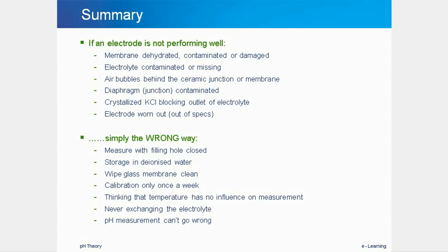As a brief summary of what one should and shouldn't do with pH measurement: causes of poor electrode performance include a dehydrated, contaminated or damaged membrane, missing or contaminated electrolyte, air bubbles behind the ceramic junction or membrane, a blocked or contaminated junction, or the electrode simply being worn out. What should never be done is keeping the filling hole closed when measuring, storing the electrode in deionized water, or wiping the membrane clean. The electrode should be calibrated often enough, temperature influence must be taken into account, the electrolyte should be changed regularly, and one should never take the measurement for granted.